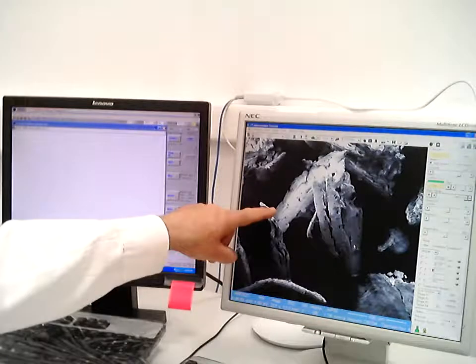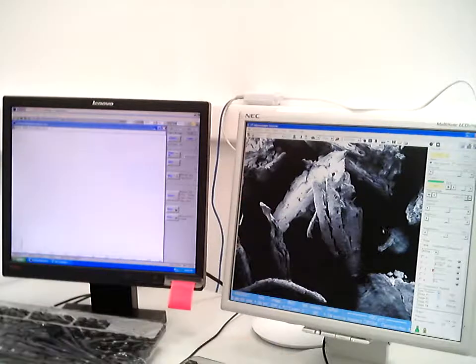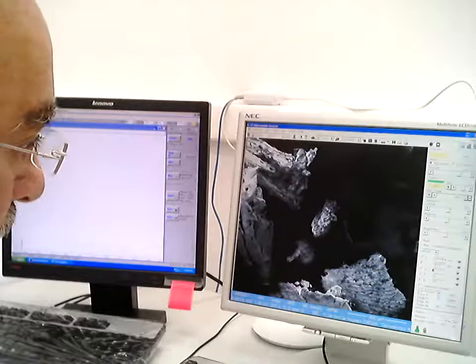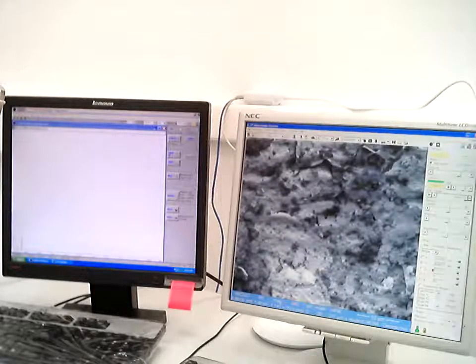You can see the fibers of the wood, and you can see the bark and things like that. But together with the particles of the wood, there's also tiny pieces of rock and soil. This is soil that contains some fibers. And we can analyze the soil because it's inorganic, and we have other programs here, and we can analyze it.